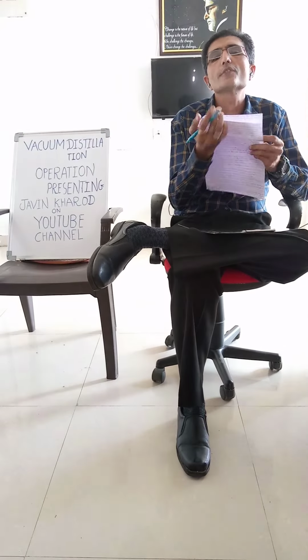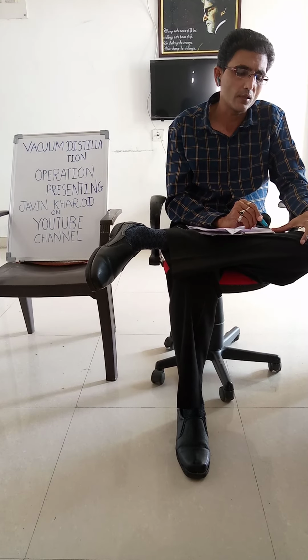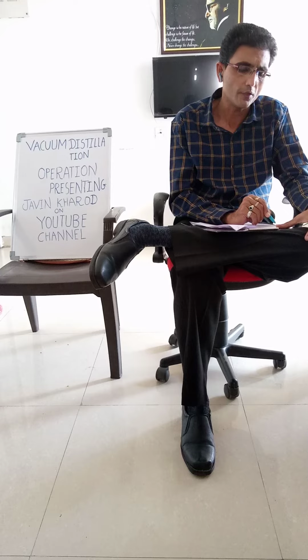The pros and cons of vacuum distillation. Vacuum distillation is performed under extremely low pressure, which would normally result in the boiling point being well below the operating temperature. So vacuum distillation is generally performed at reduced pressure.